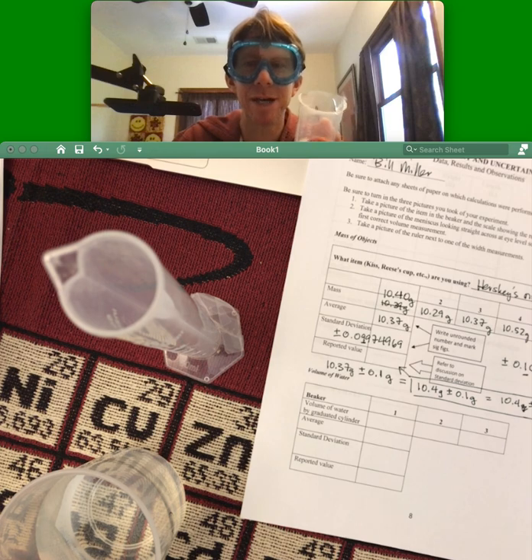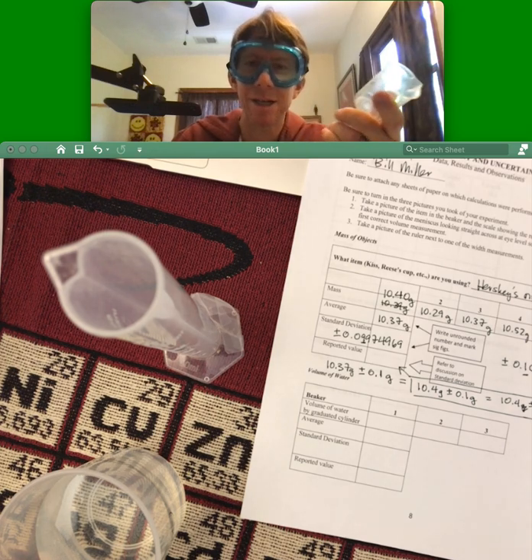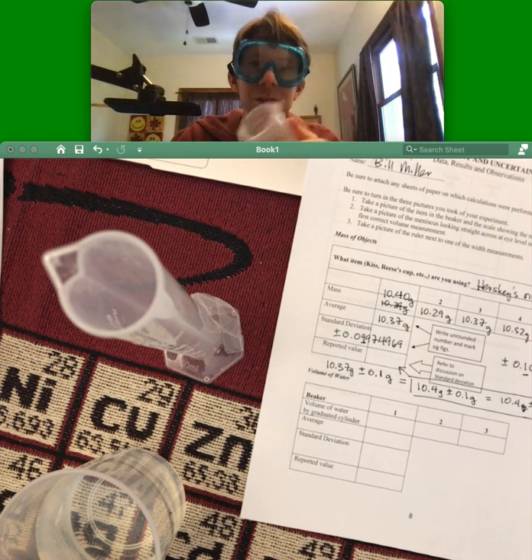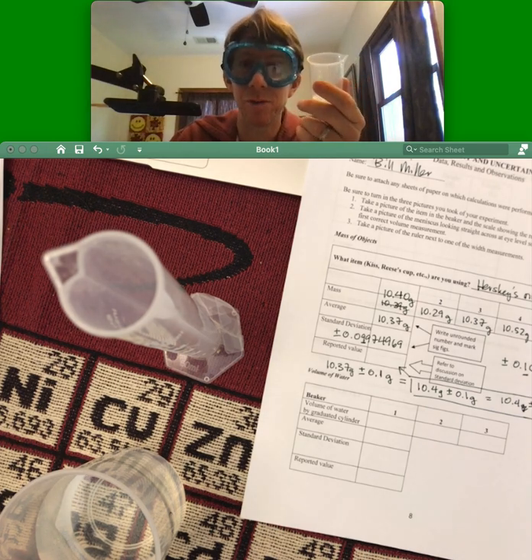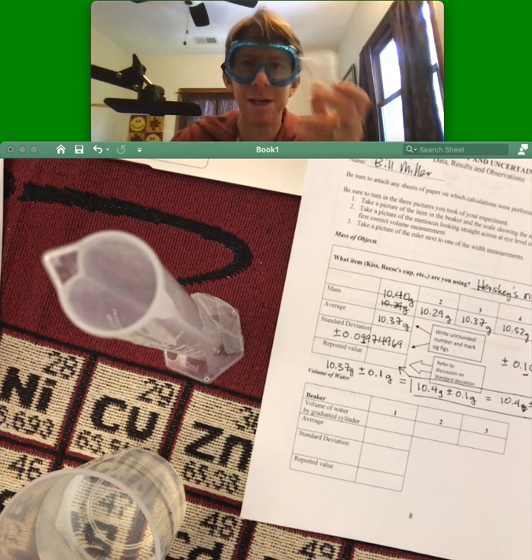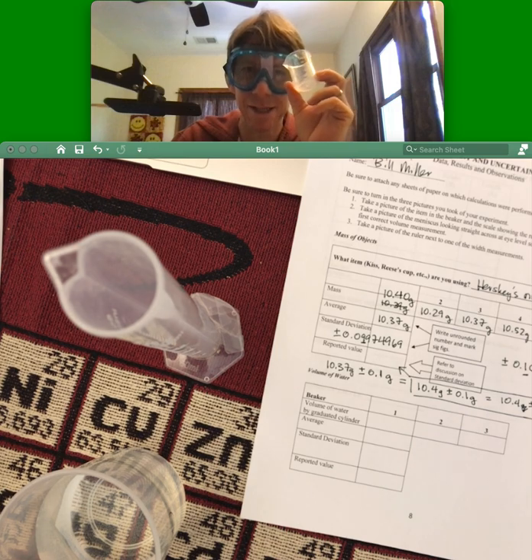So the rule of one-tenth says measure to one-tenth. This is 5, it's 0.5. And then if it's anything other than 0.1 or 0.01 or 1, go up because you don't want to overstate your accuracy. So I am actually thinking that this is only going to be good to the nearest one milliliter.